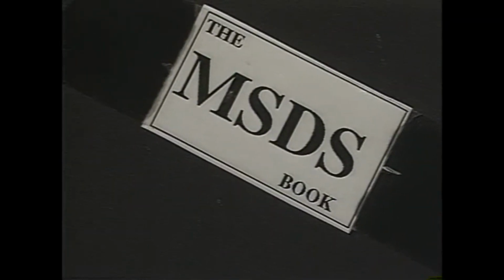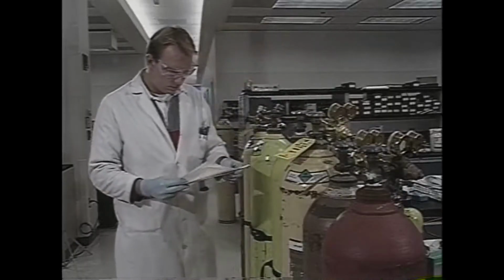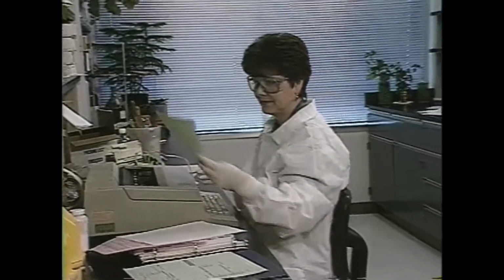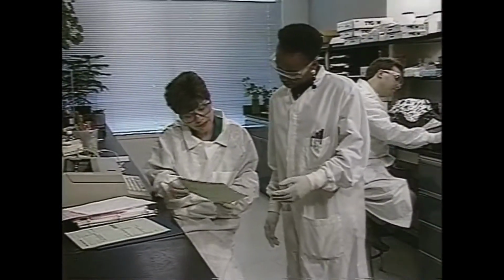Remember to read the MSDS before you work with an unfamiliar chemical. This will help you prevent problems. You should also review MSDSs from time to time while you work to make sure you are using the chemical safely. MSDSs get updated periodically, so make sure you're looking at the most recent version.